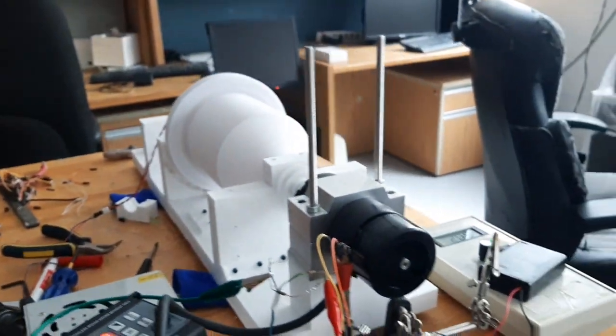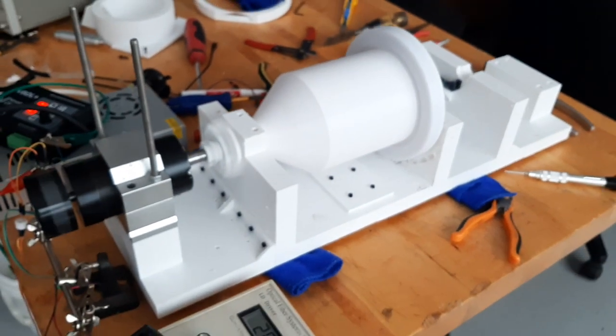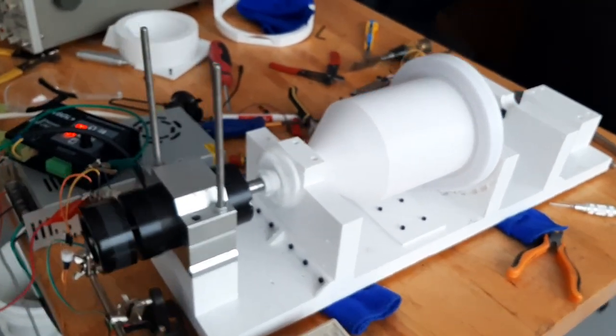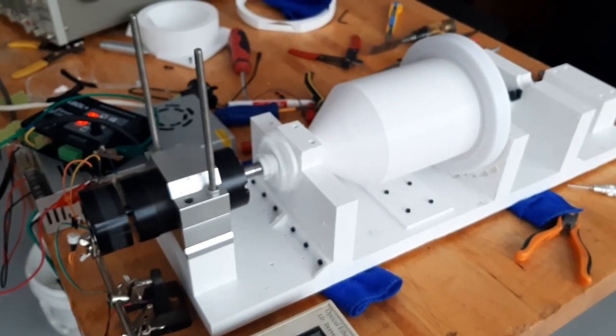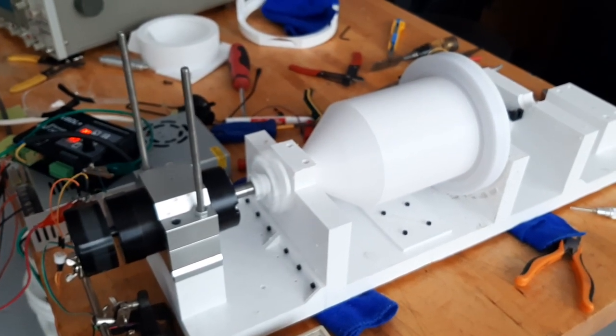Looks pretty good at 5,000 rpm. We drove it to 6,000, and at 6,000 it started to make some noise — the vibrations were a little higher — but still good.